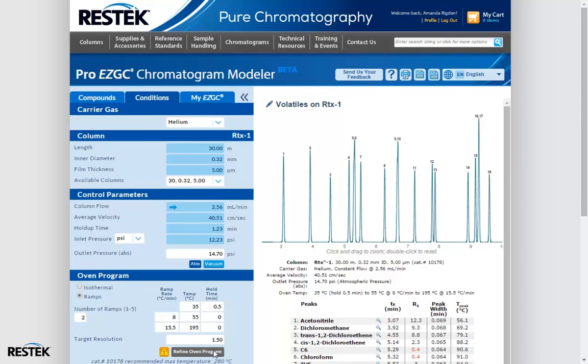First, we didn't want to only display the very fastest run possible because with larger lists some of the peaks can get really smushed together and it's possible that a user would be happier with a slightly longer run that gave better resolution. Allowing multiple refines gives the user a stepwise approach to the minimum resolution criteria that allows them to take a look at the intervening chromatograms in order to stop when they're happy.